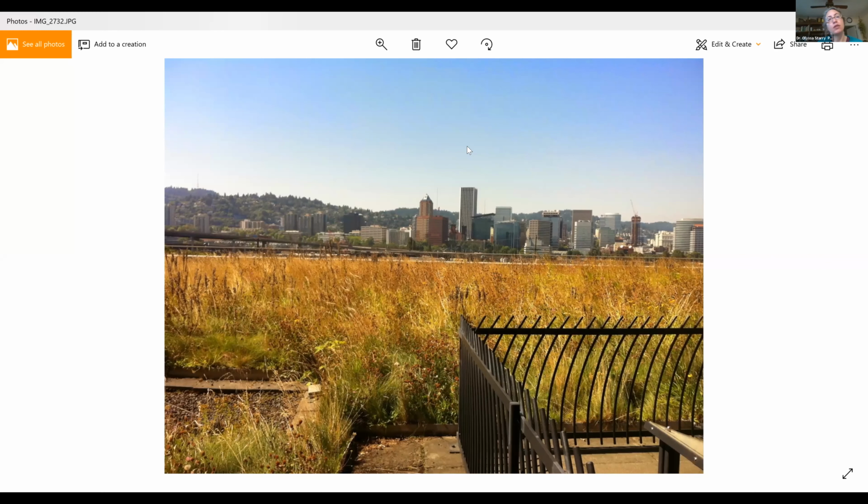And so we have a graduate student who was able to determine that there is a ratio of CO2 and water use by plants relative to the rate of ozone deposition. So you can predict ozone deposition onto a green roof surface if you know something about stomatal conductance and CO2 uptake. So we're going to use the CI-340 to validate and verify some of the measurements that we've been taking on ozone deposition and some of the ozone deposition modeling that we've been using.